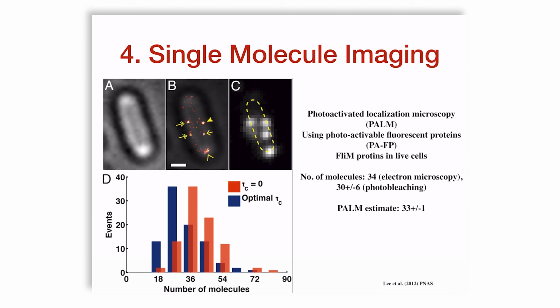And as they stay in the active state, if you image them, they will give you signal. After the passage of some time, these molecules will revert to their dark state. This dark state means you cannot see them. You cannot see them means they don't show up in a microscopic image. The molecule is there, but the light is not there. And by cyclically activating and inactivating, or activating and waiting for the spontaneous inactivation of molecules, you can sample a region and get around part of the diffraction limit.